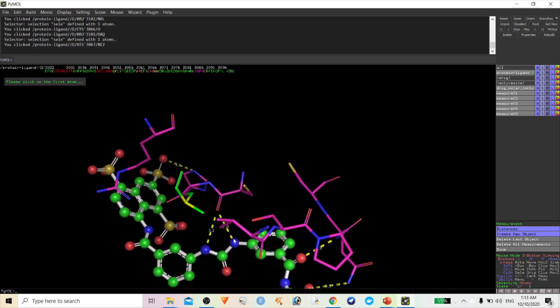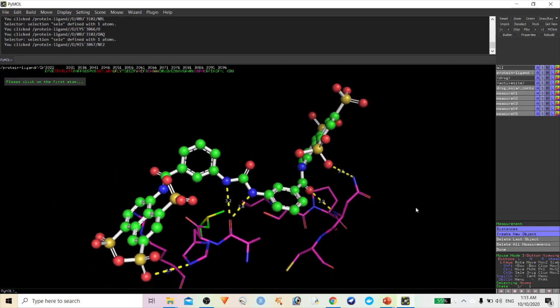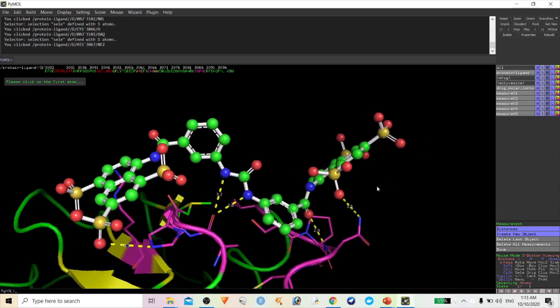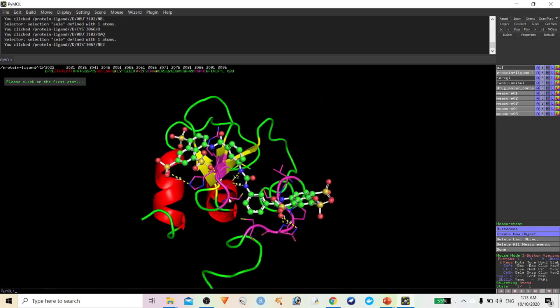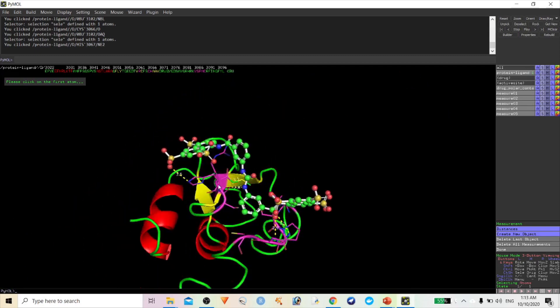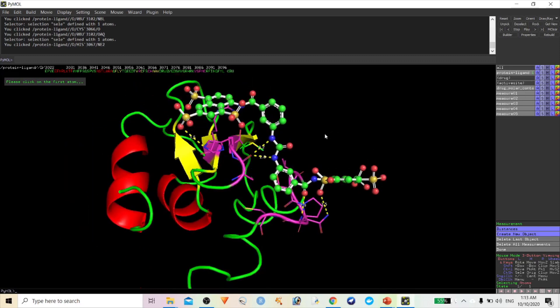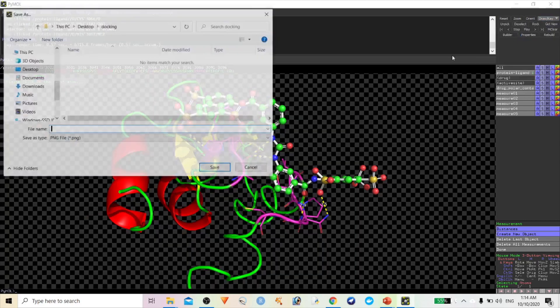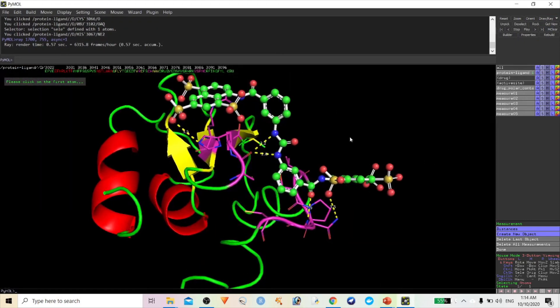This is how we can easily identify the distance between the drug molecules and protein molecules and find the active sites in a protein. For clear visualization, you can display it in cartoon form — it looks very good for publication. Simply click Ray, then Save Image, and it will save the image in PNG format.